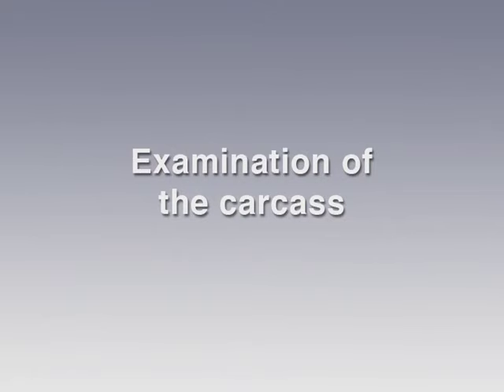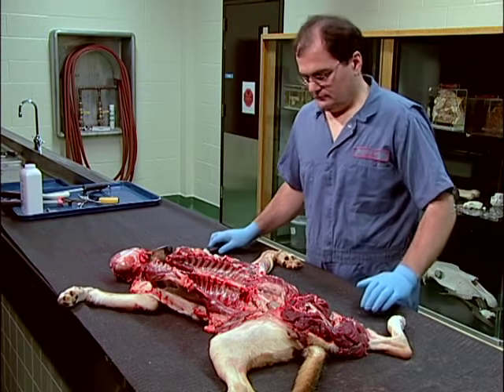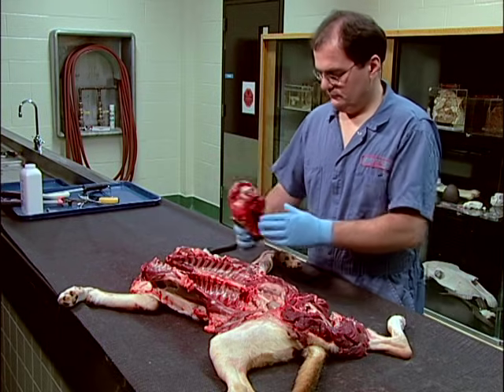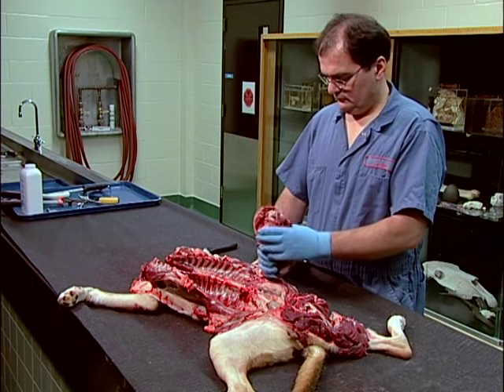Examination of the carcass. Examine and section several external and internal lymph nodes.